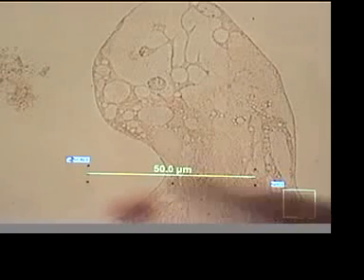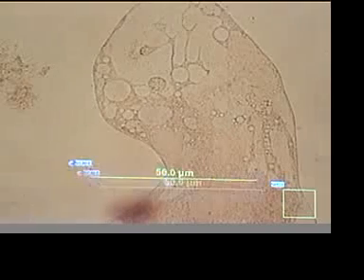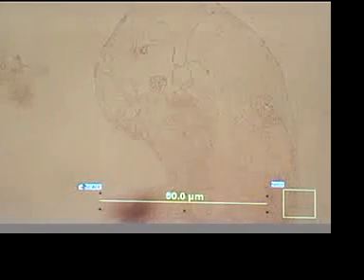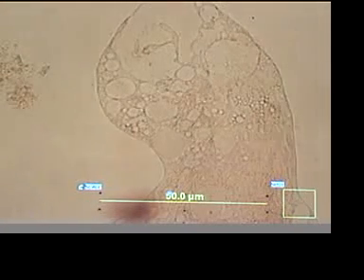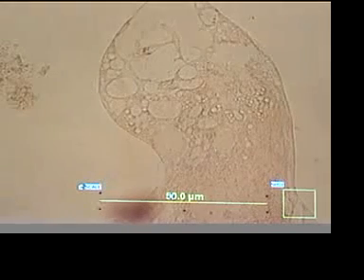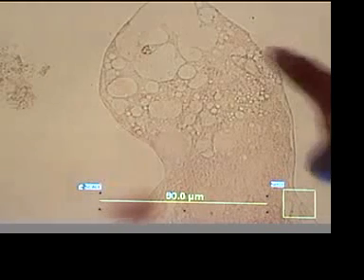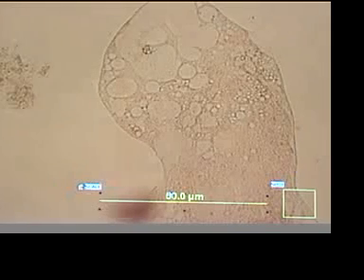I think this is more a case of the organism falling apart. I don't believe it's directed motion. I could be wrong. Oh, something's happening. Dramatic. Look at this. There's a dramatic internal rushing. Oh, and there's a blister forming right here. His cell membrane has broken.